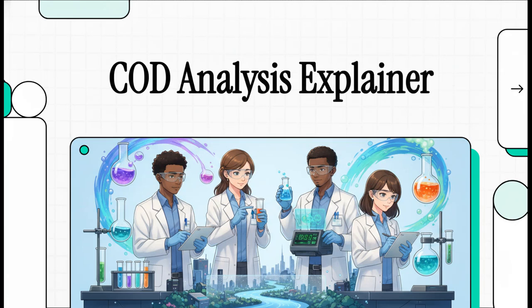Hey everyone, and welcome to the Dr. Kim Laboratory. Today, we are diving into a really crucial, hands-on explainer on how we actually measure environmental pollution. We're going to be looking at a fundamental test called chemical oxygen demand, or COD analysis. I am incredibly excited to guide you through this because it's some truly fascinating and impactful chemistry.